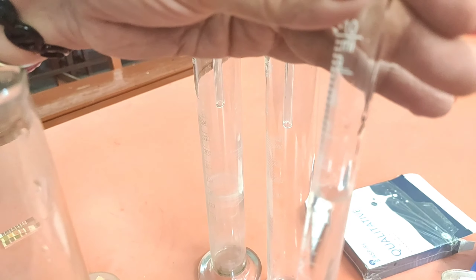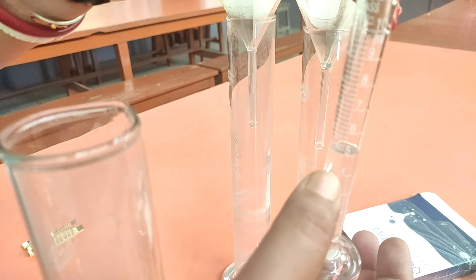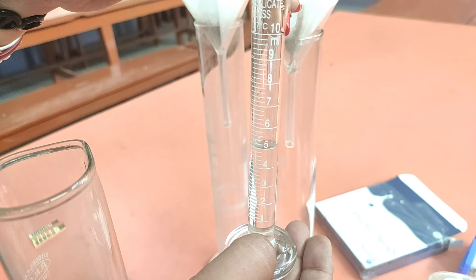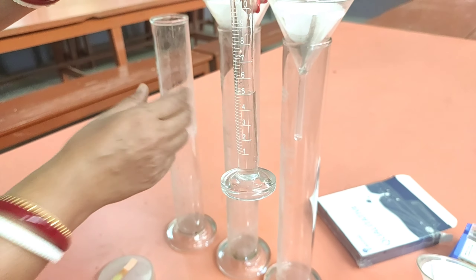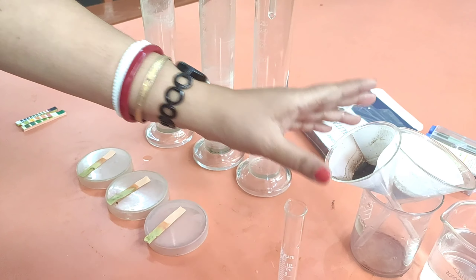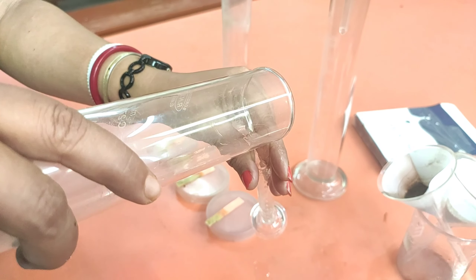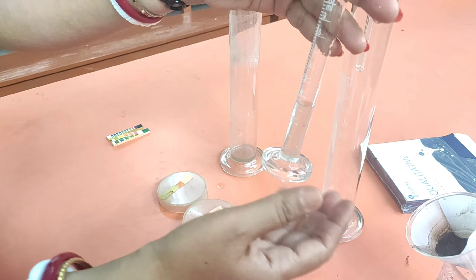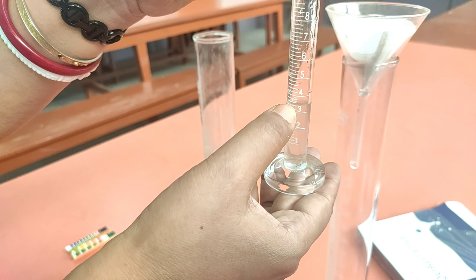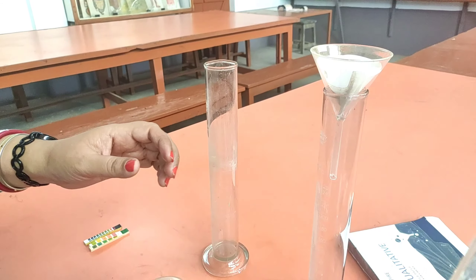The water collected from sample A is almost 5 ml. So 10 ml water was given and 5 ml water has been collected after five minutes. Now let us see what happens in the second sample. Pouring the water from sample B into the measuring cylinder — the water collected is almost 3.2 ml.